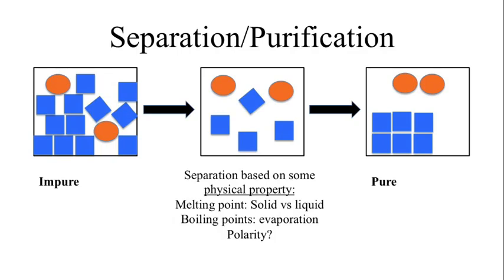Where our issue comes into play largely comes down to what field we're working in. We're dealing with organic molecules, and so an undergraduate lab. Heating it up to that kind of temperature would mean having to push into a gas phase. In an undergraduate lab, we really want to avoid the gas phase because it's not the easiest thing to work with. All sorts of hazards, particularly if they're toxic chemicals. We don't really want to run the risk of you inhaling some of these dangerous things. Okay, so that's a bit sketchy to deal with, but hey, sometimes we're exciting. We'll go ahead and do it anyway.